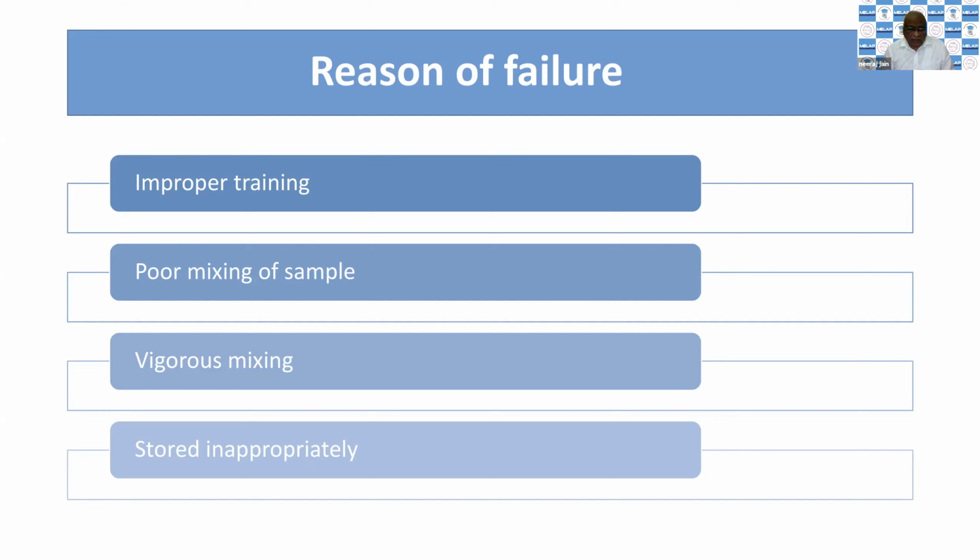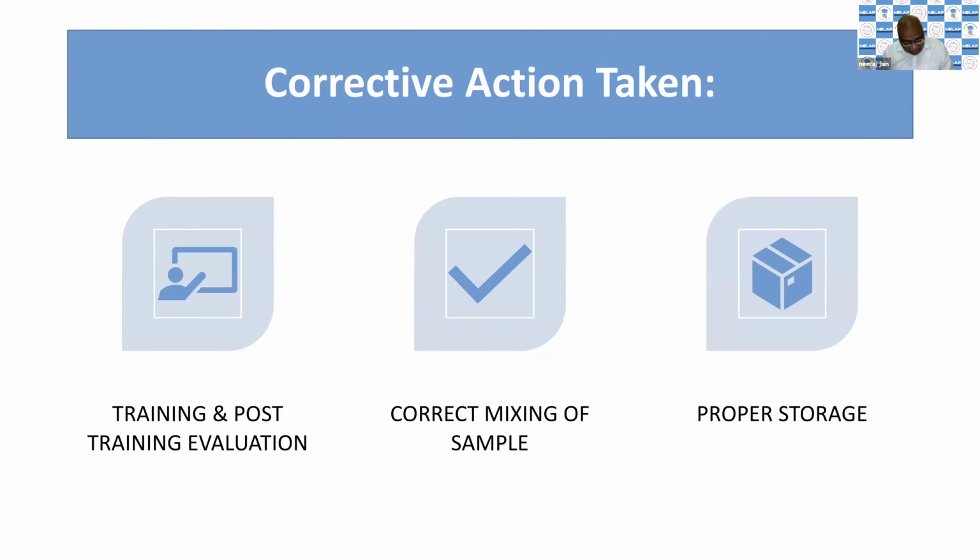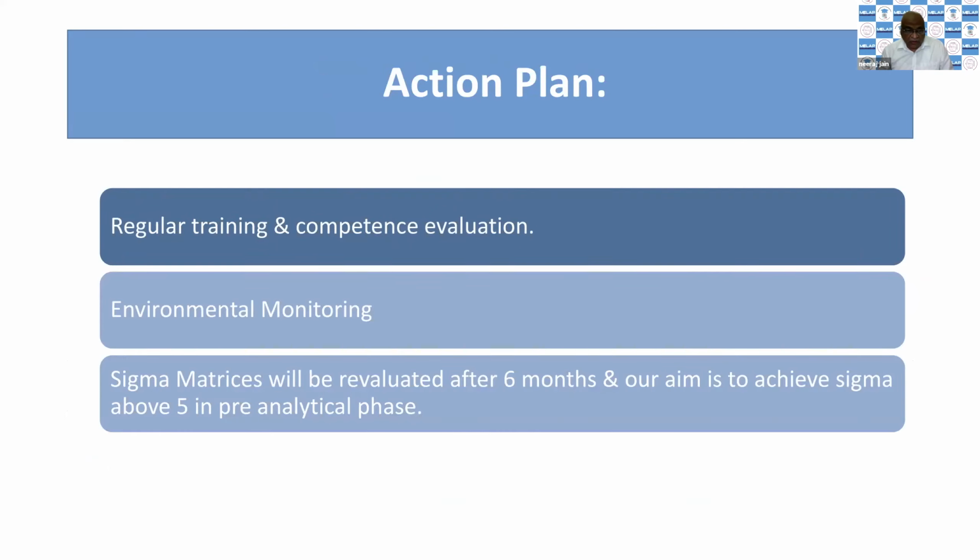Improper training of our people, and sometimes they are not mixing the sample properly because of this improper training, or sometimes they are mixing very vigorously. That is why samples are getting hemolyzed, and storage is also not proper. So we thought we will conduct training and post-training evaluation also, whether they have understood the concept of training or not. In this training, we will teach them the correct procedure of mixing and how the sample shall be stored. So we performed all these activities, regular training and competence assessment.